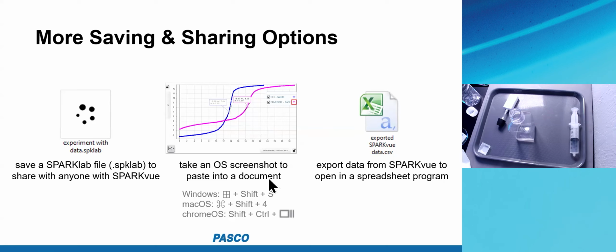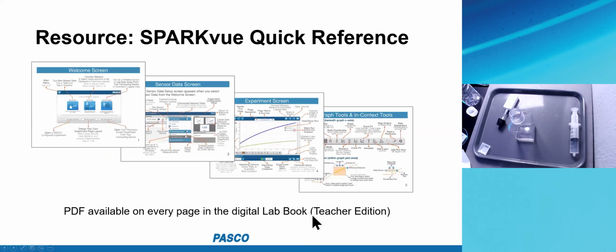But yeah, just like before, I showed you with the graph from the evaporation, you can do any analysis, even if it's multiple selections on multiple runs. Like the screenshot here showing you these two slopes, or rather tangent tools on these two runs. This came as a saved file in the titration here. Okay, now going to my presentation again to make sure I'm covering everything.